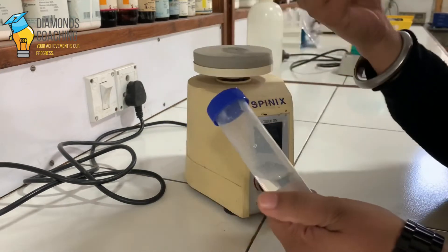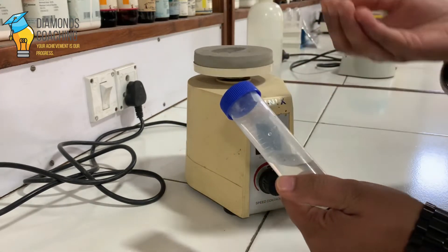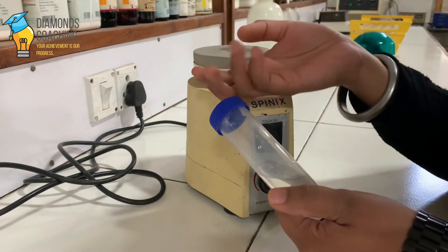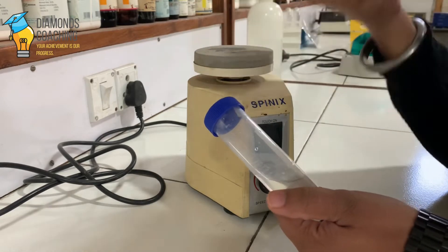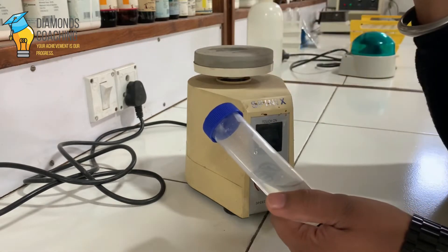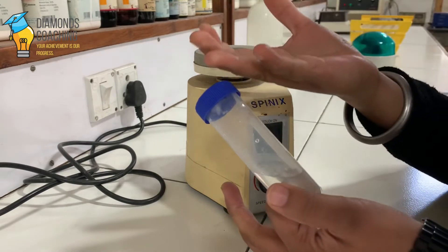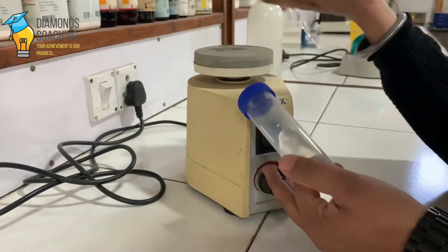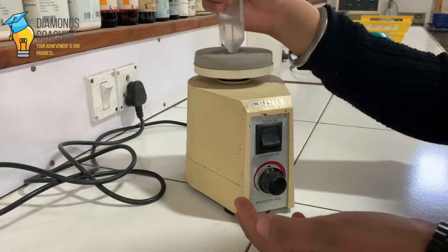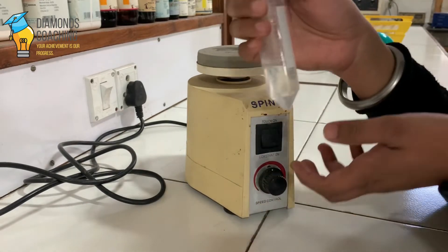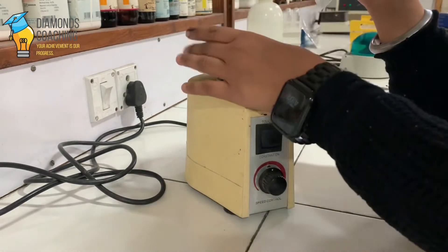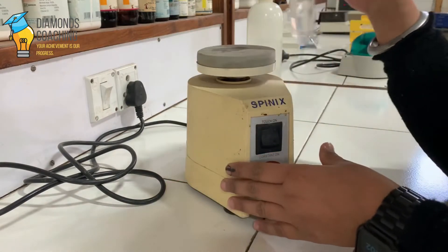Wherever in the laboratories where you are conducting any experiments - like in microbiology, in food technology, for DNA isolation - we have to mix the sample and the solvent. So this vortex shaker is used for that purpose.